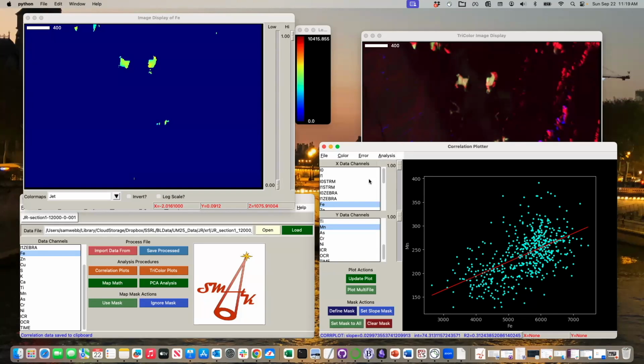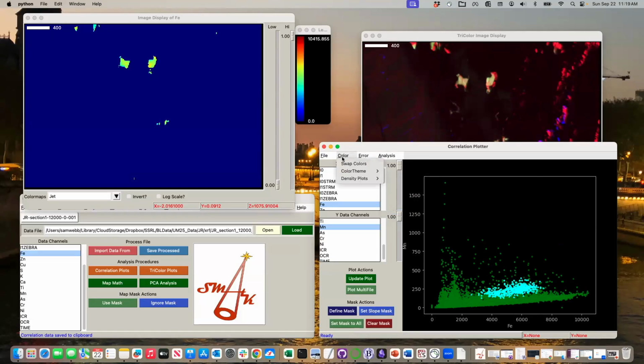If you were going back to this full data set, let's go back to none. There are also times when you're looking at multiple correlations in the data set. You may want to fit both of those, not have it overly biased.